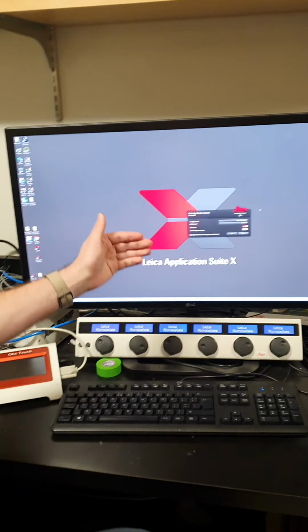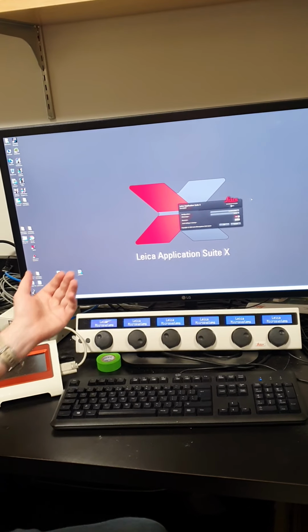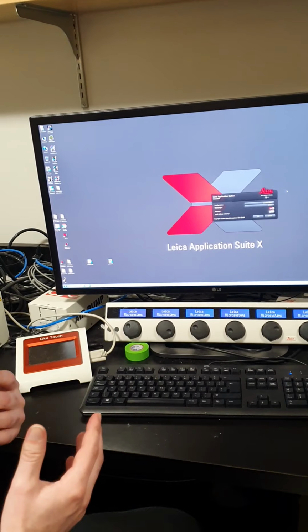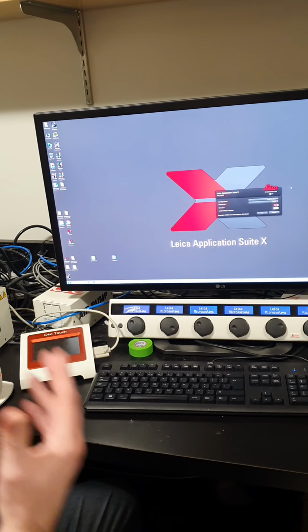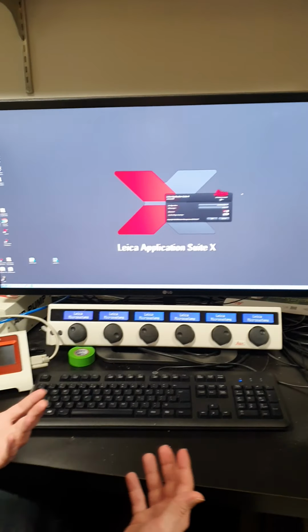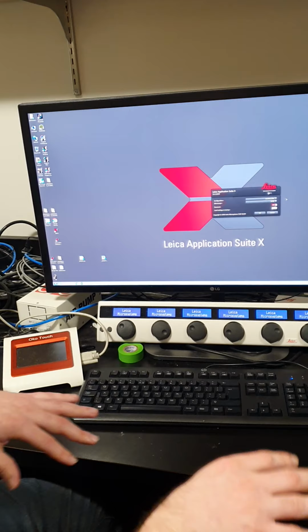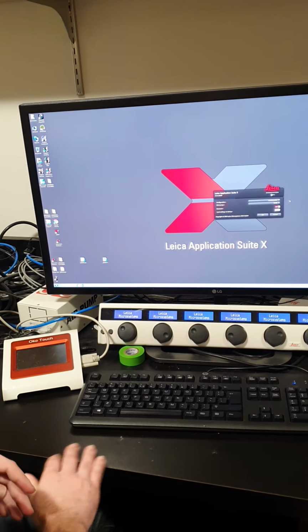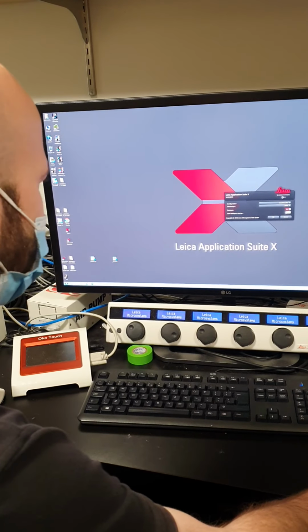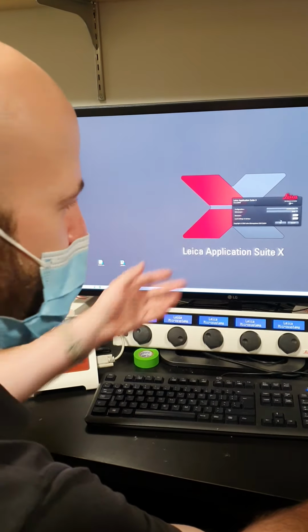So this is used if you're trying to look at very fast live cell processes, like cardiomyocyte contractility or cardiomyocyte calcium flux, where you need very high frame rates. So if you're doing 50 or 100 or 200 images a second. But you wouldn't want to use that if you're not looking at something very fast, because it doesn't give you the option of going slower for better quality. And this last one, load settings at startup, you can just ignore and leave that off.